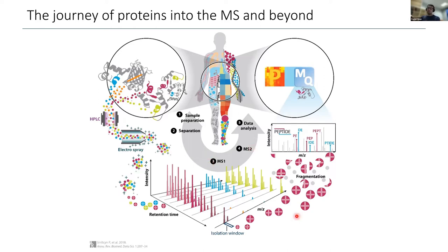And this is visualized here by these intact ions here with the pluses. And in the MS2, they are fragmented. So we're looking at the fragments of these peptide ions. And indeed, it's the fragment pattern, the information about the fragment ions that tells us the sequence of the peptides, and that allows us to identify peptides and hence identify proteins, whereas the MS1 signal is often used for the quantification. So that's why I highlighted these two levels, because they're really omnipresent in proteomics experiments.